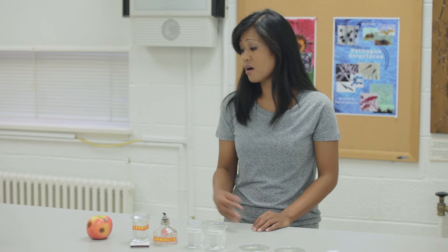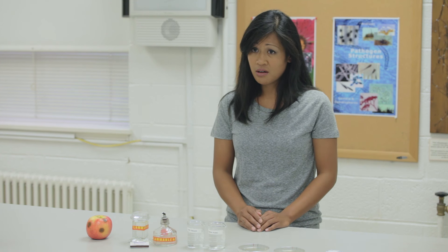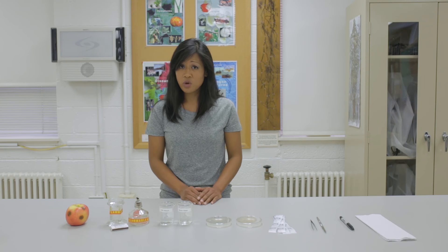In order to complete step two of Koch's postulates, we'll need our symptomatic apple, 95% ethyl alcohol, matches and an alcohol burner, 10% bleach solution, sterile water, petri plates containing a growth medium, parafilm strips to wrap the plates, forceps, scalpel, sharpie, and paper towels.